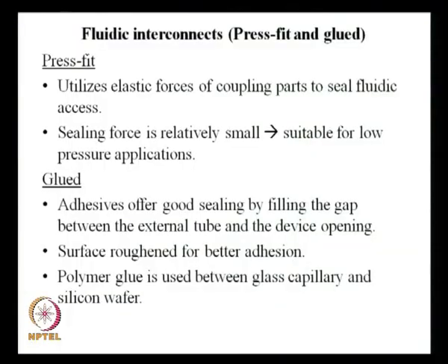So, for that we talked about the press fit, and we said that the limitation is that the moment you have higher pressure inside this device, liquid will start leaking from that port. In case of glued, you apply adhesives. These adhesives offer good sealing by filling the gap between the external tube and the device opening.